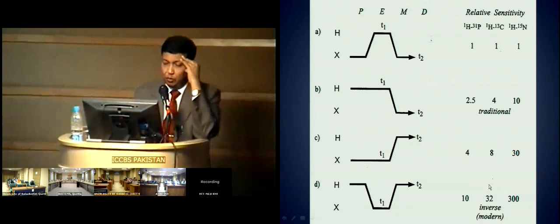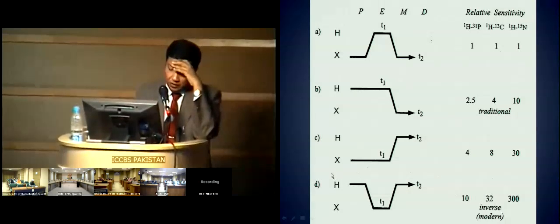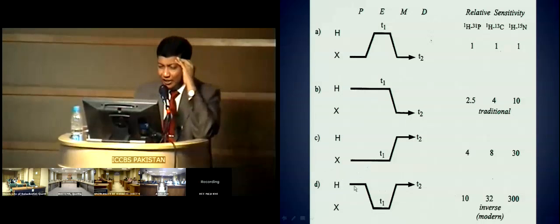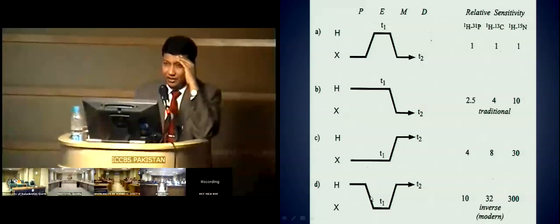But this is the most modern NMR, inverse NMR spectroscopy, in which human ingenuity has actually solved the problem of, as they say, two birds with one stone, one gun, one spoon, I don't know what. Anyway, you can kill birds with anything actually, depending on what you have.